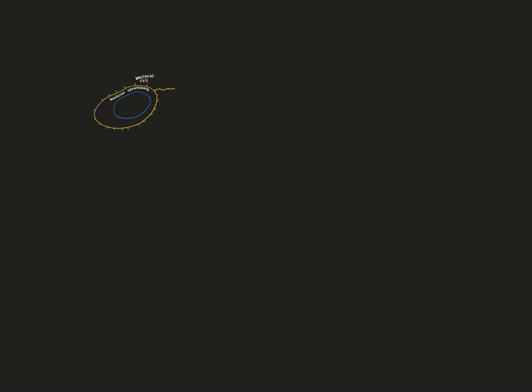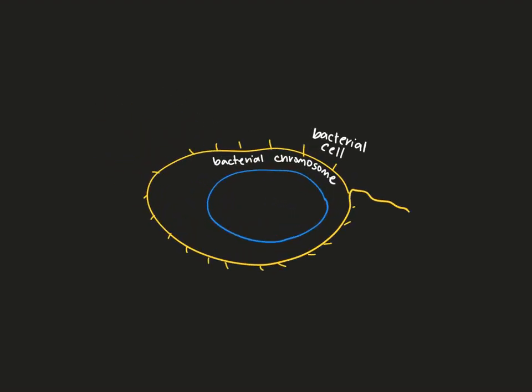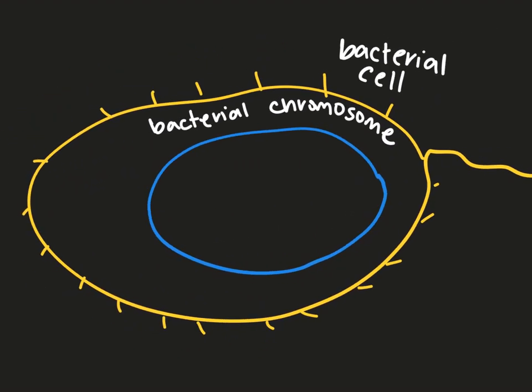So let's talk about bacteria for a second, and let's imagine that in my perfect genomics world, I want to sequence the genome of this bacterial cell. So what I could do in my perfect world is just zoom into this cell. Say, oh, there's your big circular bacterial chromosome, and I want to sequence it. I want to read all the A's and G's and T's and C's, and so maybe I pick somewhere and I start going along and reading that sequence. And I could just do this linearly for the whole, if this is E. coli, 4 million some base pairs in order to see the entire genomic sequence of that one cell.